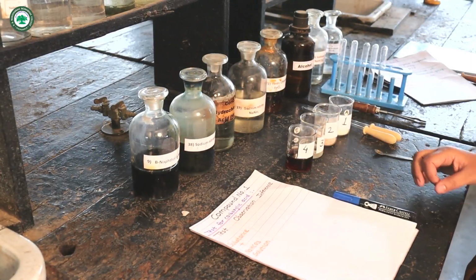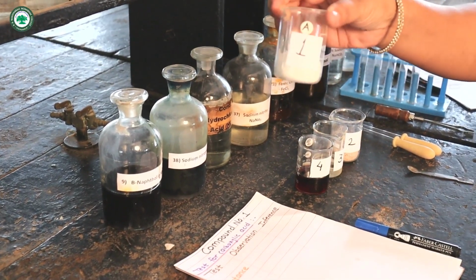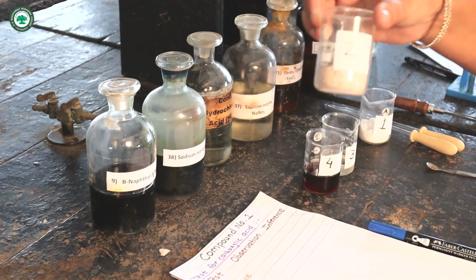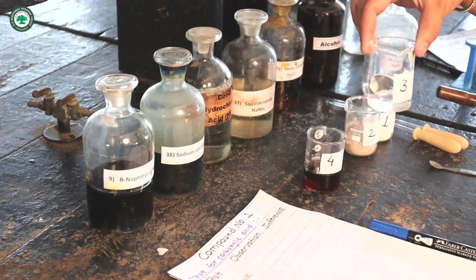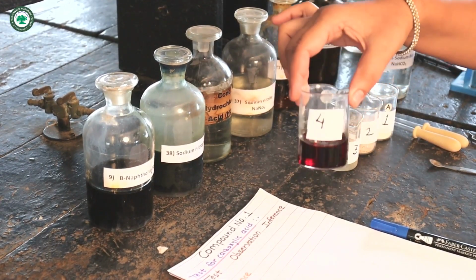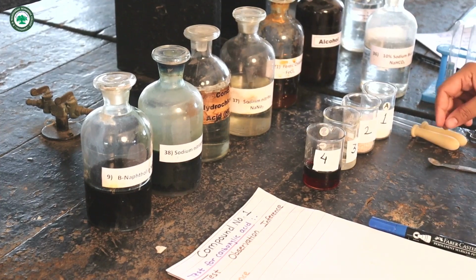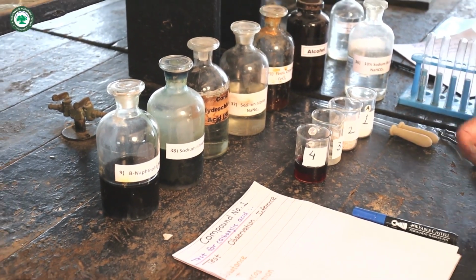We have to detect the functional group of these 4 compounds: compound first, compound second, compound third, and compound 4. For this, first we will start with compound number first. What is the test?